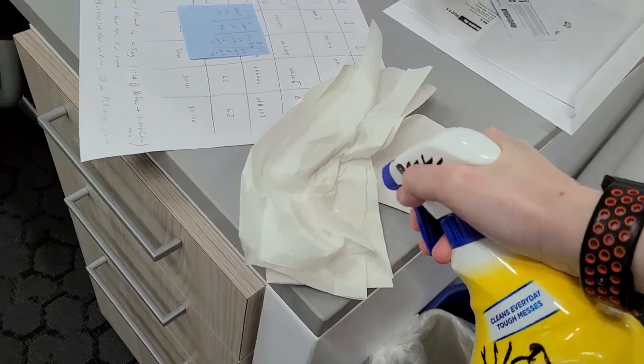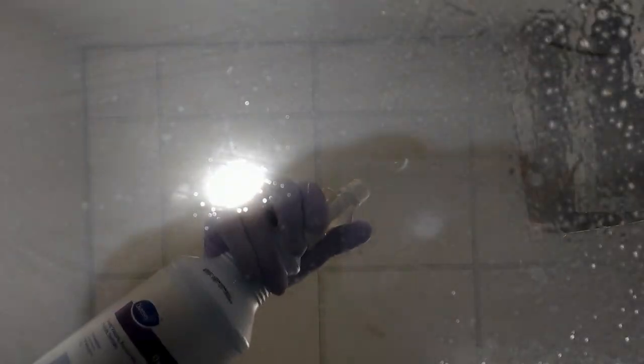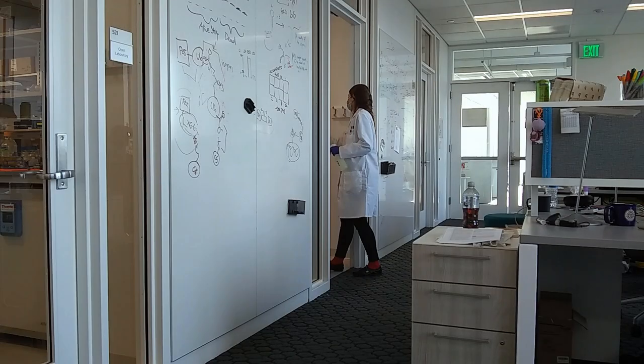Okay, just finishing up for the day. It's dark outside. At the end of each shift, we have a policy where we go through and we clean the high-touch surfaces. Rigorous cleaning of any commonly used equipment and other things in the lab, like even door handles and fridge handles and things like that.